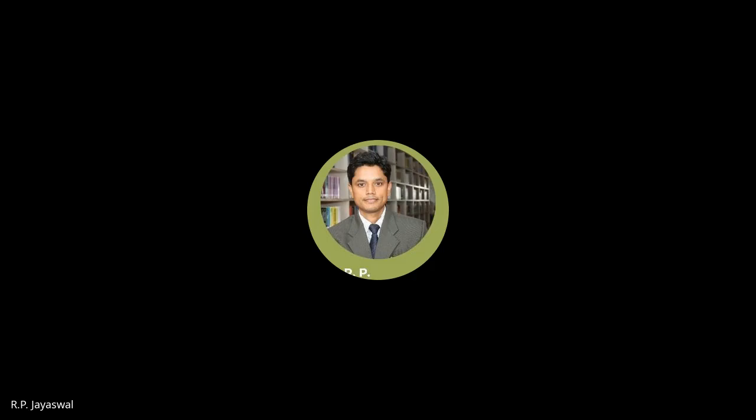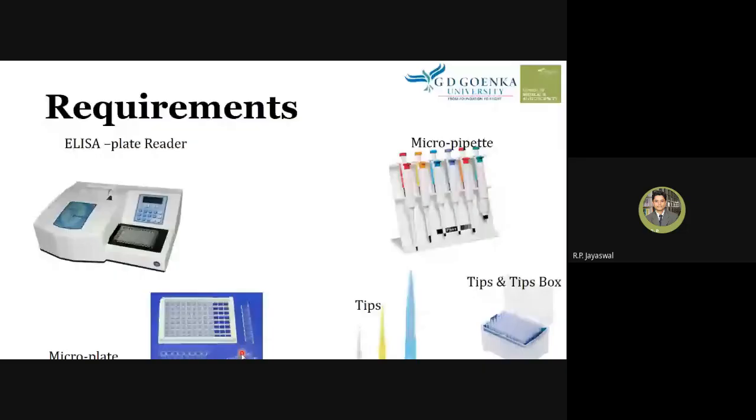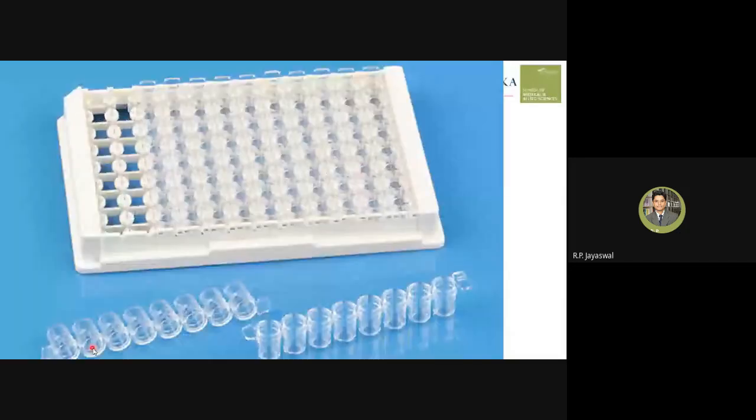What is the ELISA plate reader? This is the microplate with holders, and this is the micropipette or precision pipette. This is the tips, and this is the tip box. This is how we need to assemble the microwells in the holder.